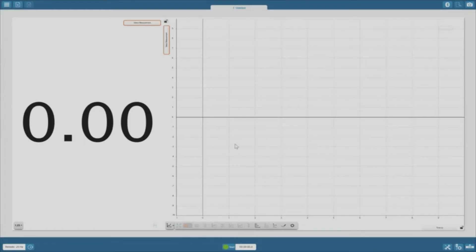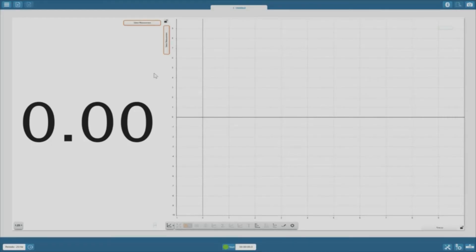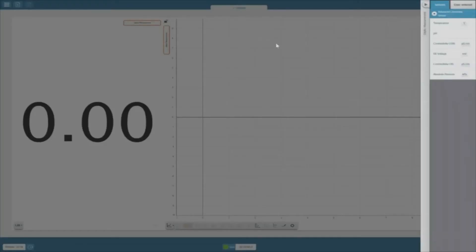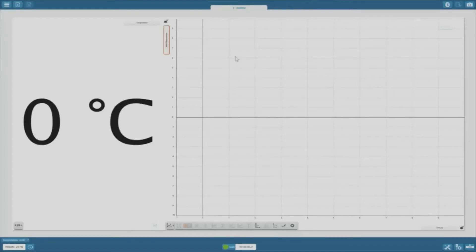Now let's look at the display panels. We've assigned the program a layout and type of display for our data, but now we need to tell it what we want to measure. We do this by clicking the select measurement buttons. For this experiment, we want to measure temperature, so I'll assign both of these panels to measure temperature in degrees Celsius.